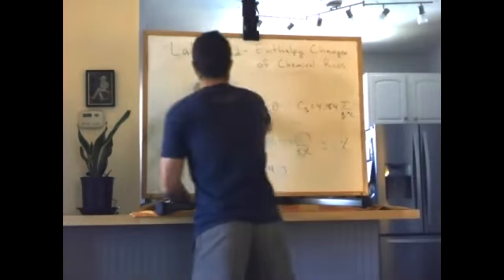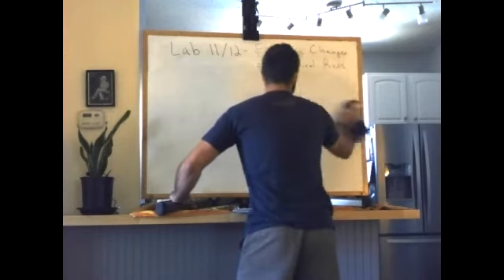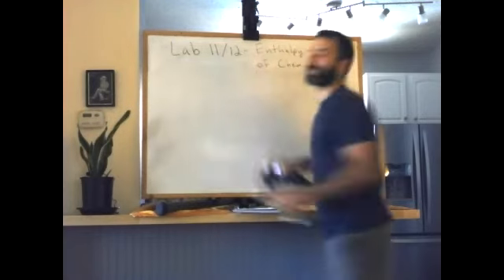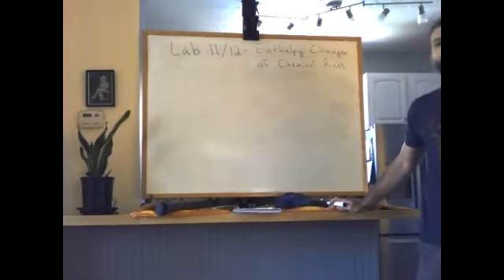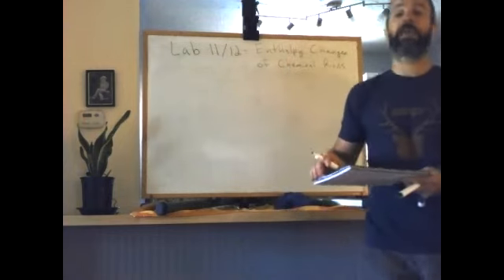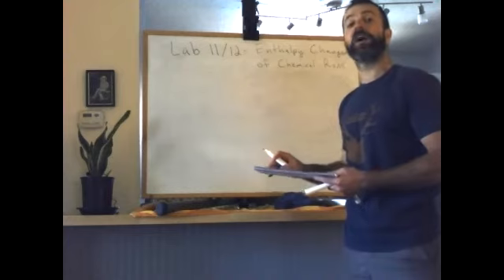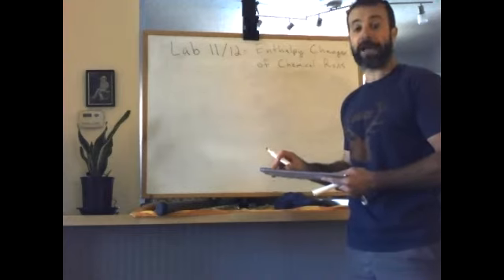All right, in this lab, a confusing part for a lot of students is the sign of the heat. Is it positive? Is it negative? I would say do not worry about the sign at all until we're trying to find the heat of our 2 reactions.